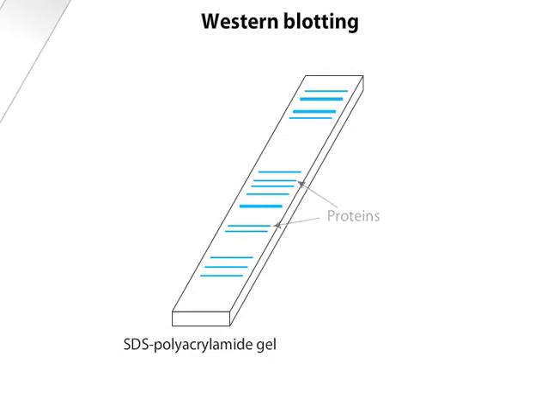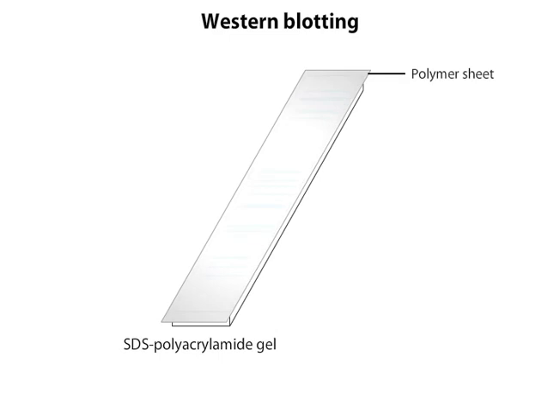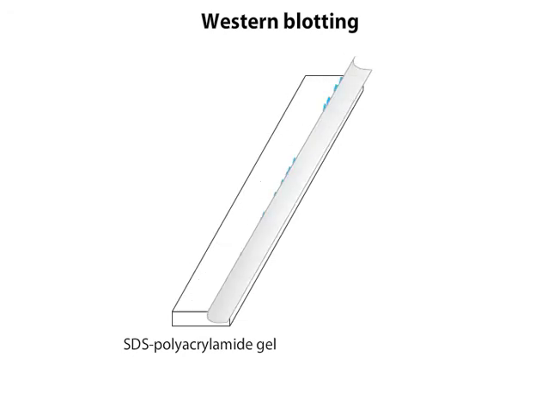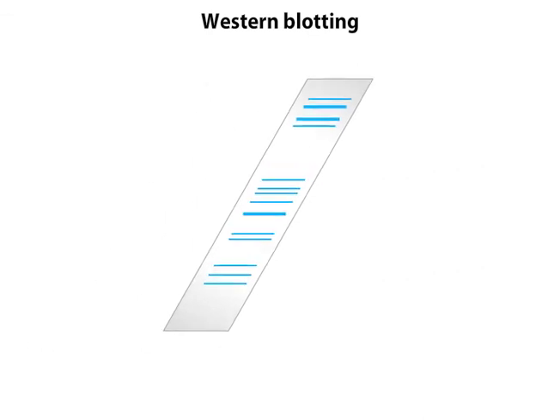In this technique, proteins are transferred from an SDS-PAGE gel to a polymer sheet in the blotting step. Protein transfer from the gel to the polymer sheet is done by electrophoresis. In an electric field generated by a power supply, the proteins, which are coated with negatively charged SDS molecules, migrate toward the positive electrode. As the proteins migrate out of the gel, they are captured on the sheet. The proteins stick to the sheet in the same positions they had in the gel. Thus, the sheet is an exact replica, or blot, of the gel. The empty gel is discarded.